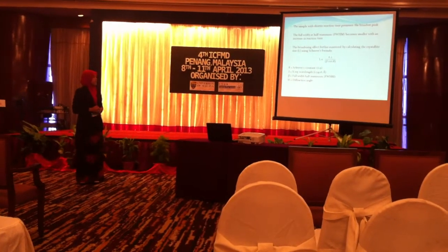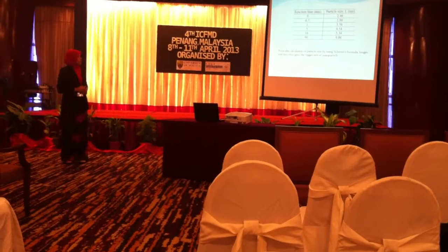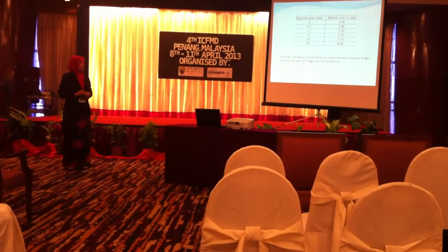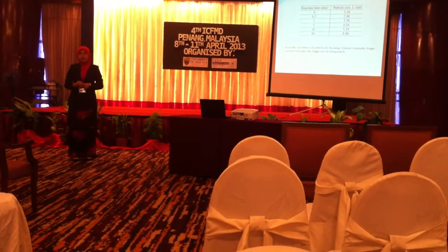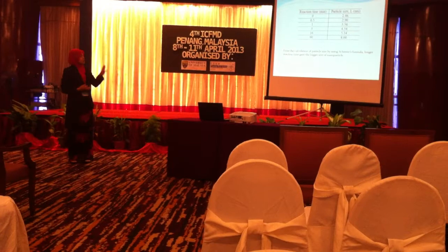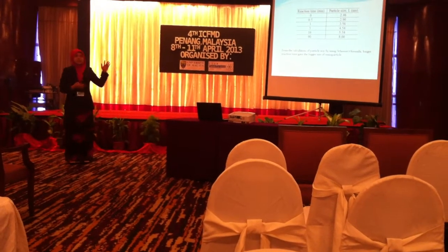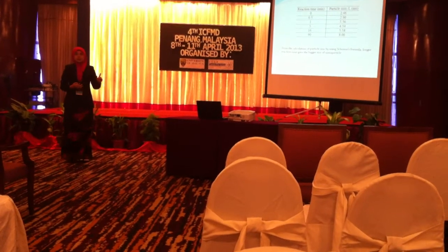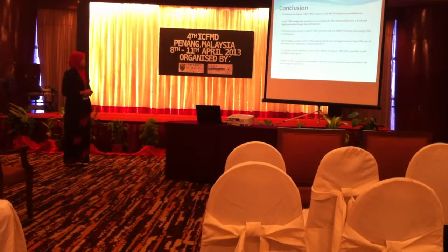So here is given the formula with its constant, and from the formula I calculate the particle size. The longer reaction time gave the bigger size of nanoparticles. So when the reaction time increases, the particle size also increases. So it agrees with the TEM result.